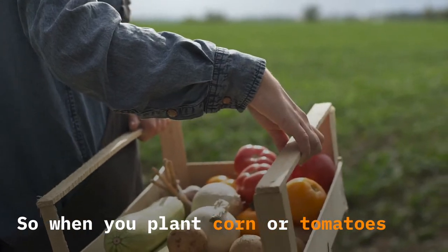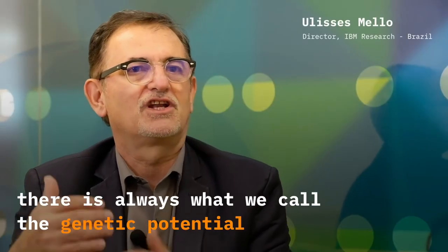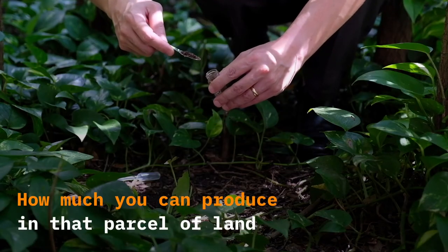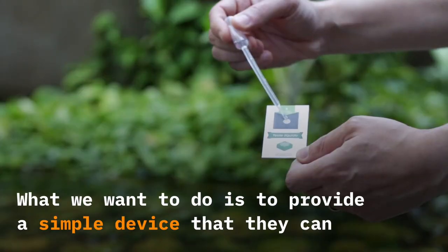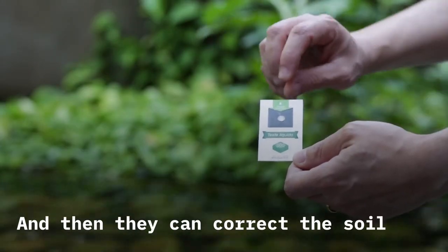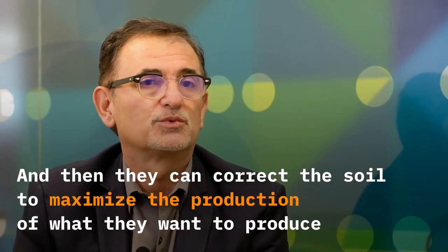When you plant corn or tomatoes, there is always what we call the genetic potential, how much you can produce in that parcel of land. What we want to do is provide a simple device that they can test the soil, and then they can correct the soil to maximize the production of what they want to produce.